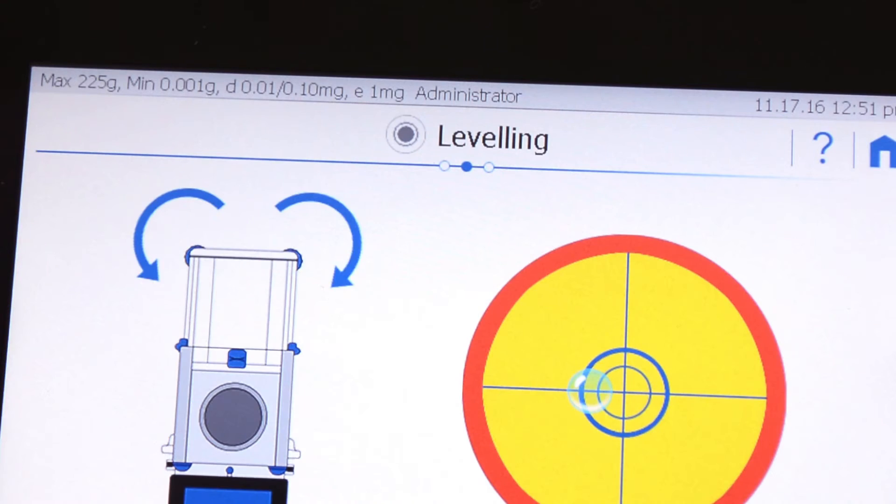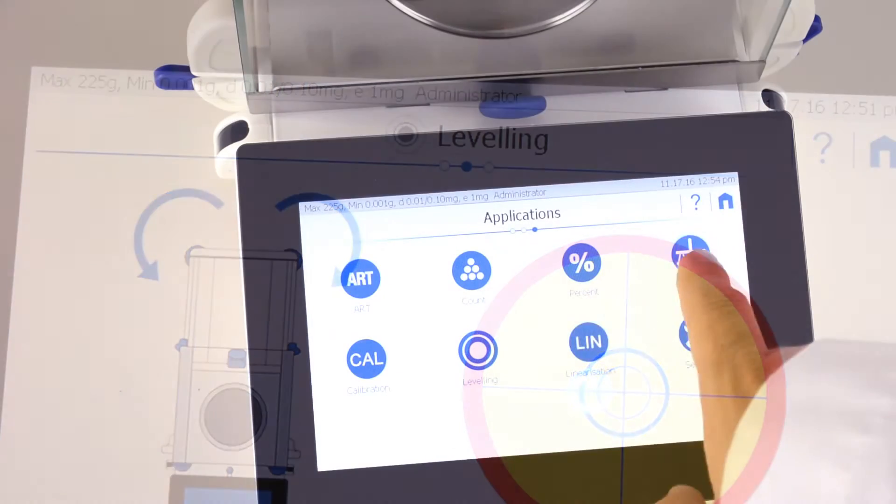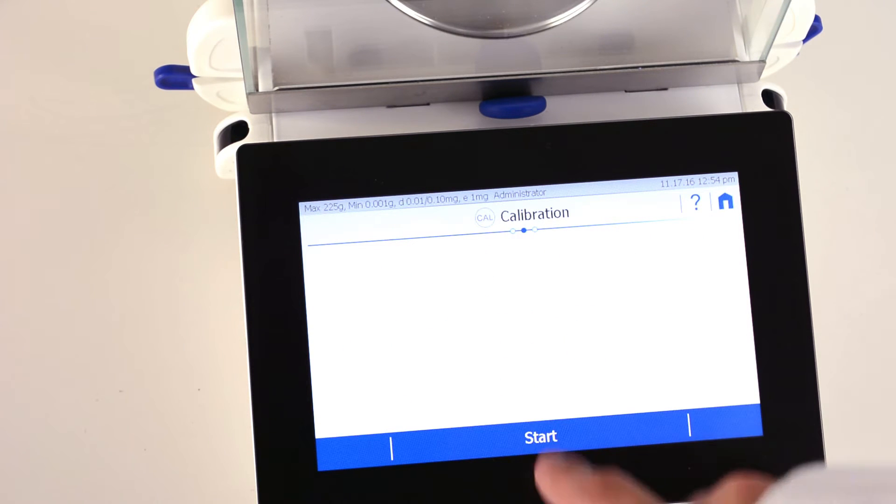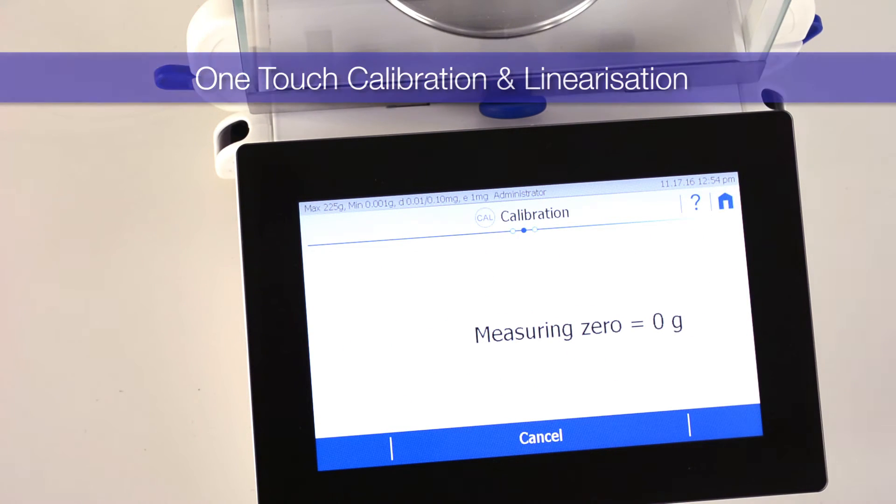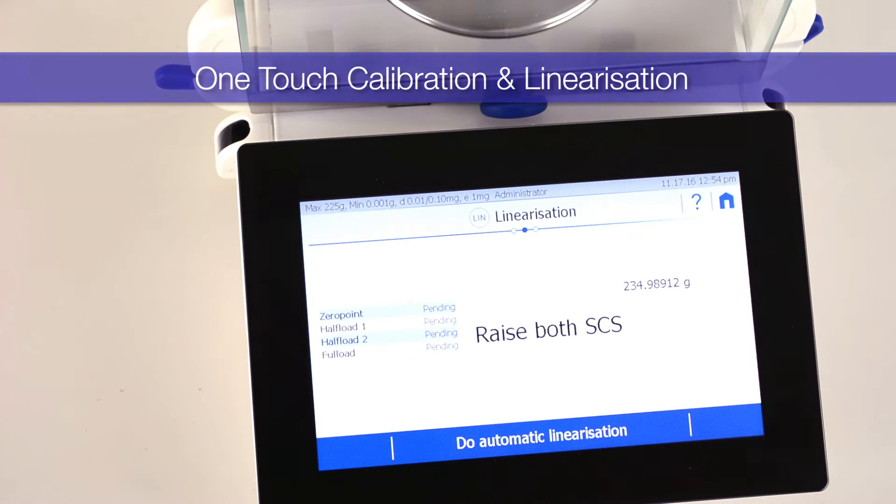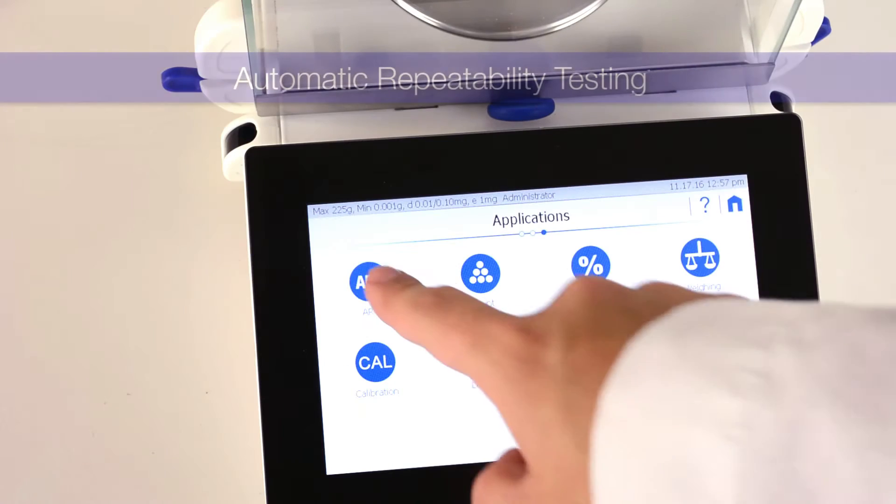All these actions can be accessed by swiping to the right and selecting the corresponding app. Calibration takes only one touch, as does linearization with the self-linearization system. You can test repeatability with the automatic repeatability test app.